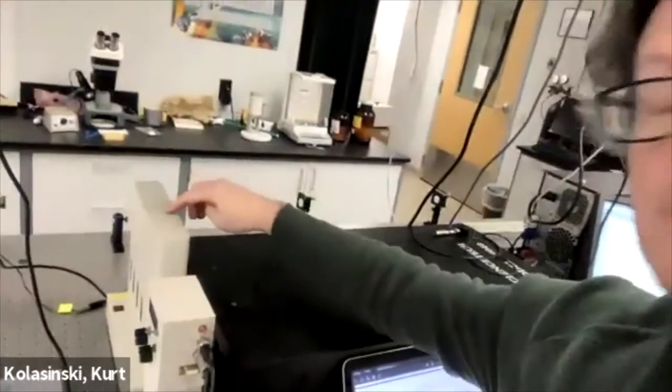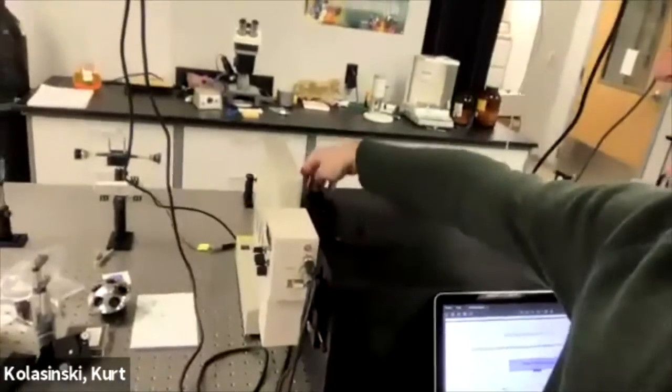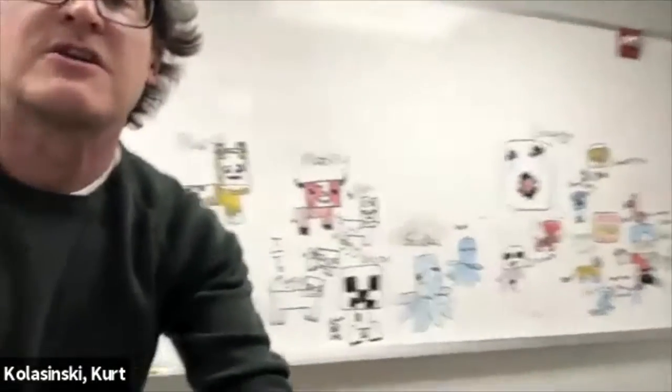We're going to look at that light using this big black box - the spectrometer. Inside the spectrometer, we've got the lamp, and there are two micrometers. We're going to adjust those micrometers on the entrance slit and before our detector. The detector is a photomultiplier tube - a PMT.